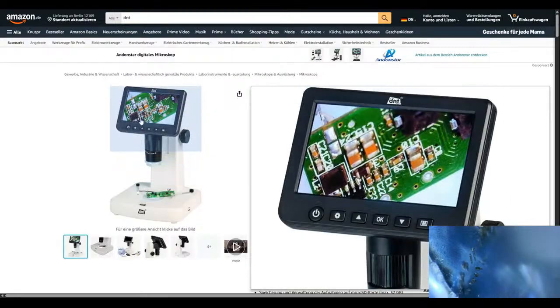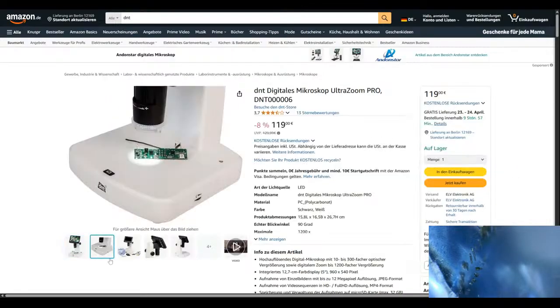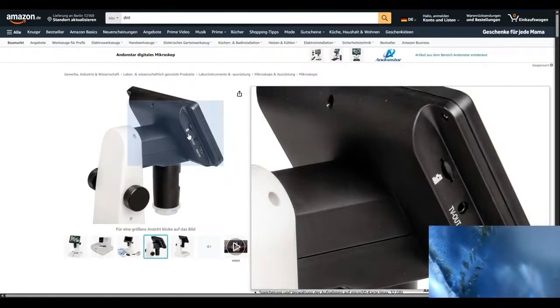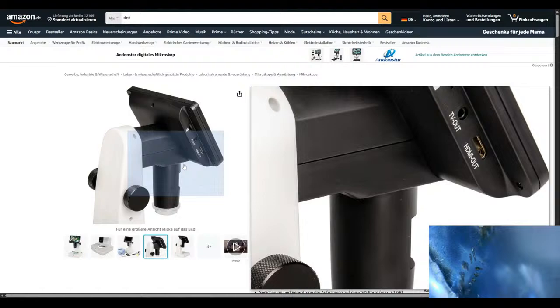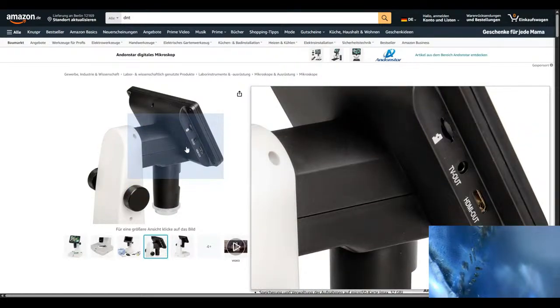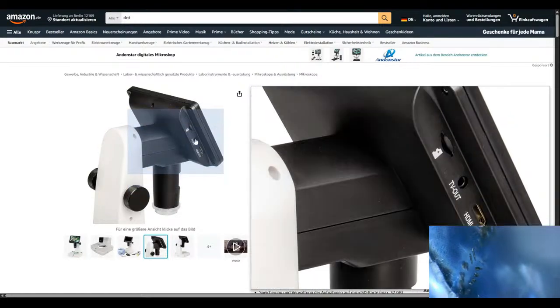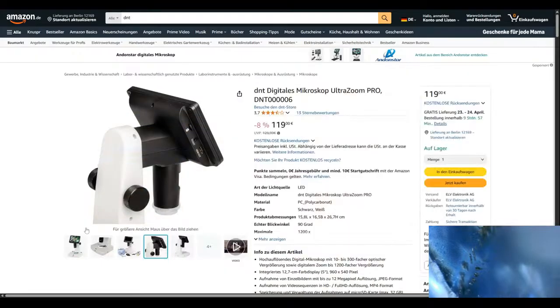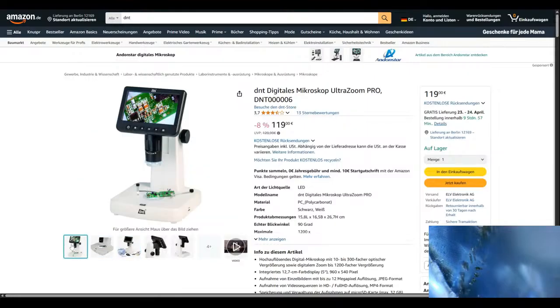for. If I give you a cable that you can connect to your smartphone and you can record onto your phone directly, or you have to do the SD card. Those are the only limitations. So you can connect TV out or HDMI to your phone, and then record with your phone. Those are the limitations.